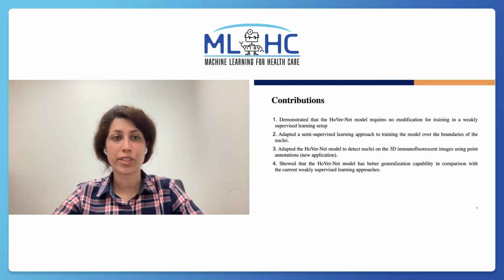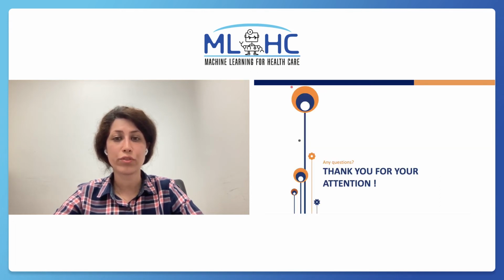These are our contributions. First, we demonstrate that the HoverNet model requires no modification for training in a weakly supervised learning setup. Second, we adopt a semi-supervised learning approach to train the model over the boundaries of the nuclei. Third, we adopt the HoverNet model to detect nuclei on the three-dimensional immunofluorescent images using point annotation. And finally, we show that the HoverNet model has better generalization capability in comparison with the current weakly supervised learning approaches. Thank you for your attention.